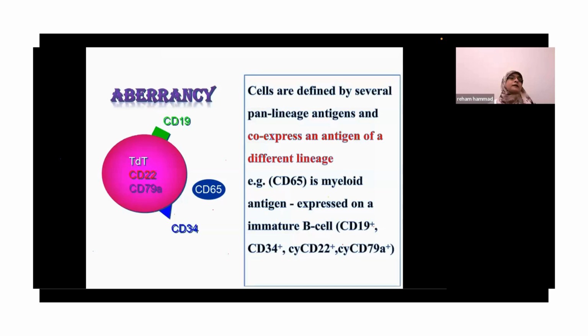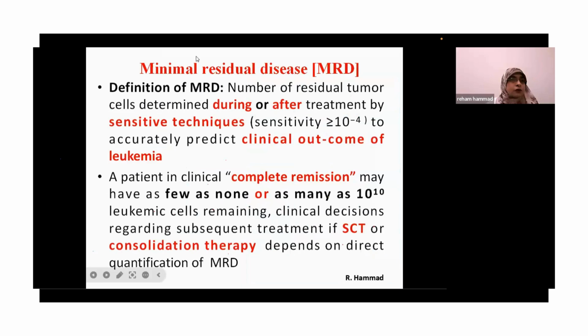So why is it important to know those things? What makes this important if you are going to tackle flow cytometry? This is going to be very, very important when we talk about minimal residual disease. Please remember that, as Dr. Sally has manifested in her wonderful lecture on the molecular side, when you are seeing minimal residual disease with the molecular techniques, you are actually looking for the expression of an abnormal protein by the cell. With flow cytometry, you are going to tackle minimal residual disease by searching for abnormal cells.